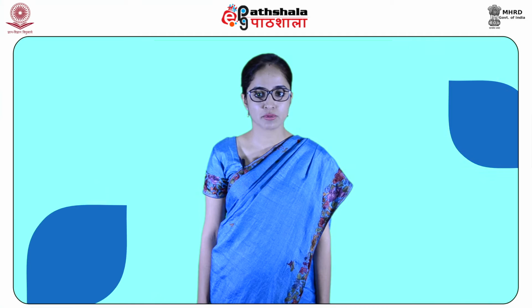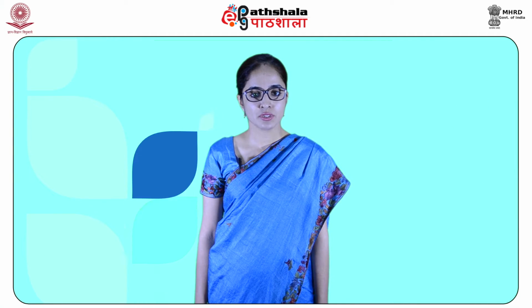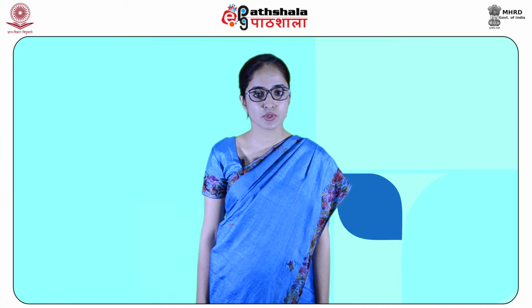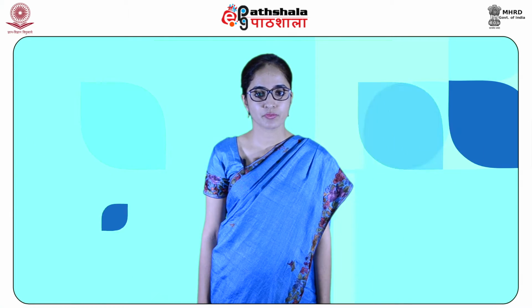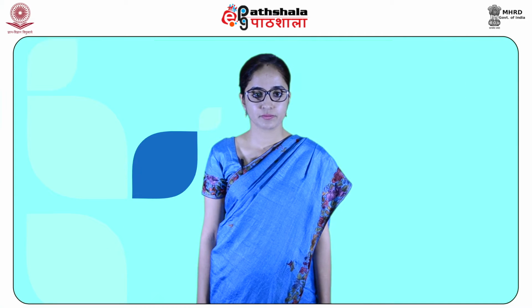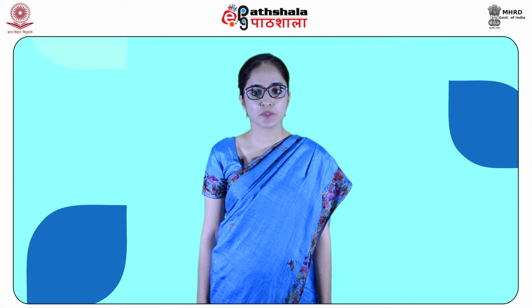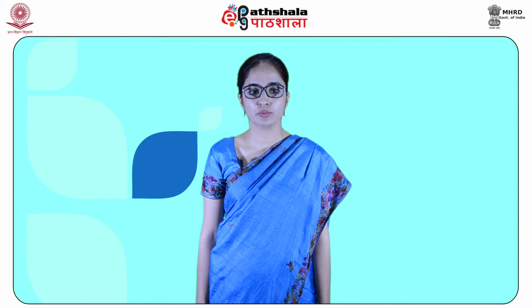The 15N NMR spectroscopy is employed to determine the structure of nitrogen containing compounds. Nitrogen, as you know, has two isotopes, that is 14 nitrogen and 15 nitrogen, and both are NMR active. 14 nitrogen has a nuclear spin of 1, whereas 15 nitrogen has a nuclear spin value of 1/2.